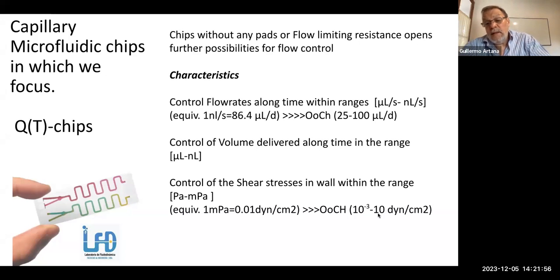And for people that work on organ-on-a-chip, 1 millipascal is about 0.01 dyne per square centimeter, and usually people in organ-on-a-chip work within this range.